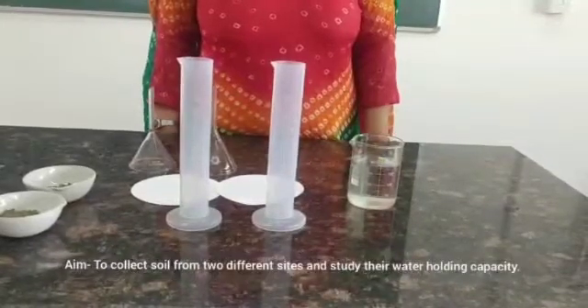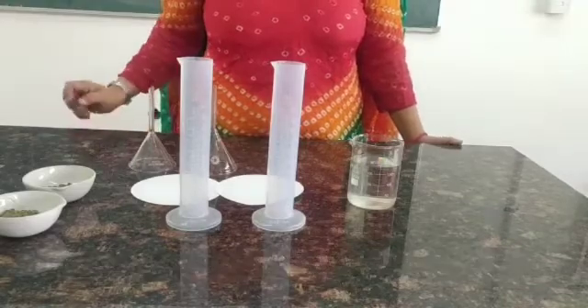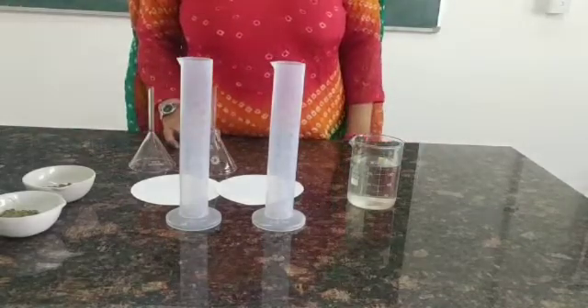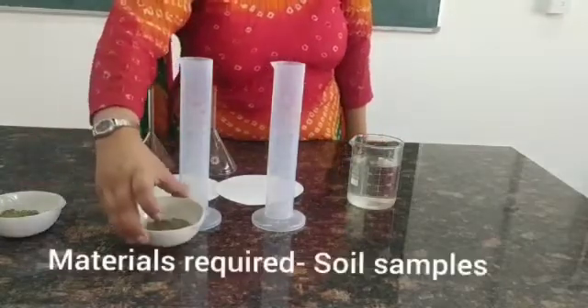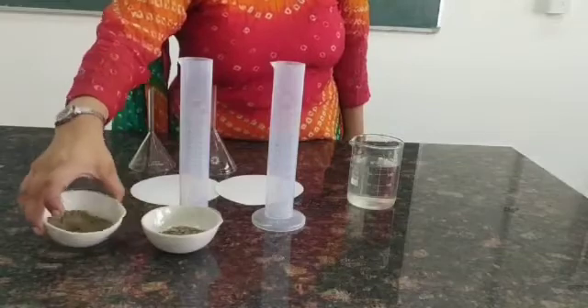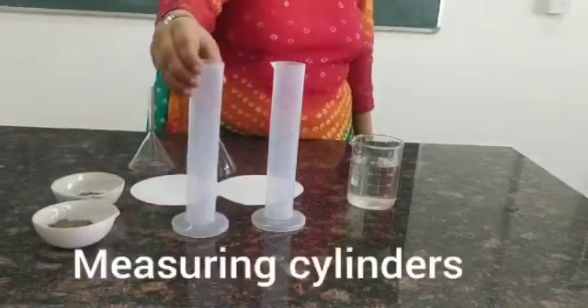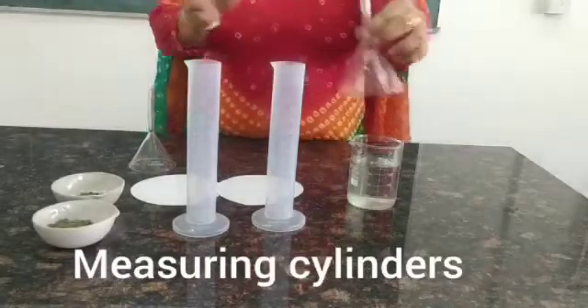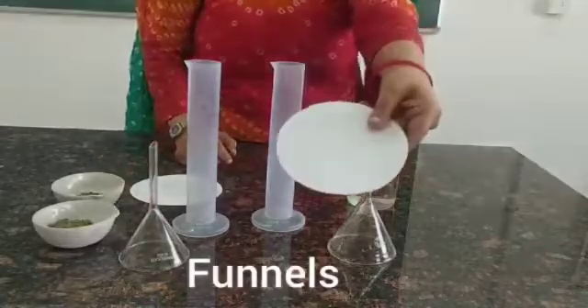We aim to collect soil from two different sites and study their water holding capacity. Materials required: soil samples — garden side soil and roadside soil. We also require two measuring cylinders, two funnels, filter paper, and water.